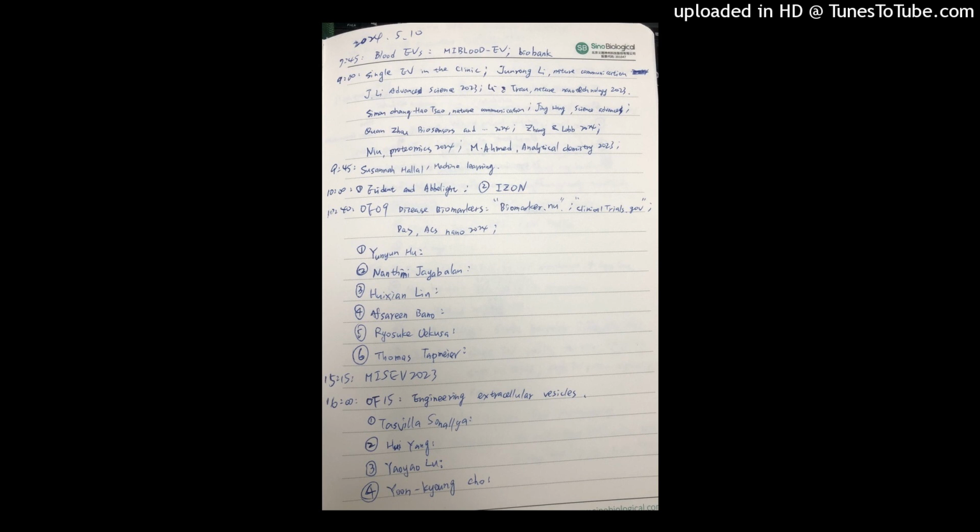So this project started some time ago at Oxford as the master's and then DPhil project of Hannah Nasri, who had a poster yesterday. So the plug is a bit late now, but I hope you went and talked to her. She did a pilot experiment to show that we can actually isolate EVs from peritoneal fluid directly without culturing anything in between, and then do proteomics on the contents.